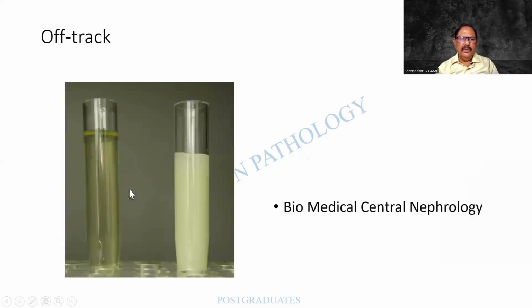Now, there's not a sample of semen, but a patient was asked to give us urine. He brought it something like this, and then they said it should not be semen, and again he had to bring it. He again brought it, again it was appearing milky white. It is a case of chyluria, where the lymph is there, similar to the semen in appearance.